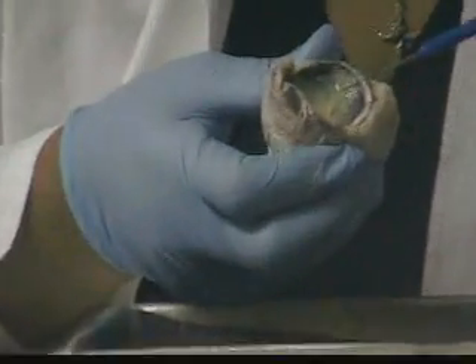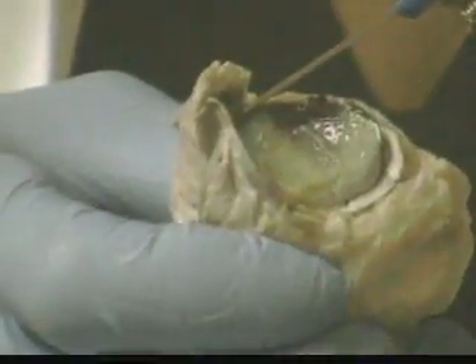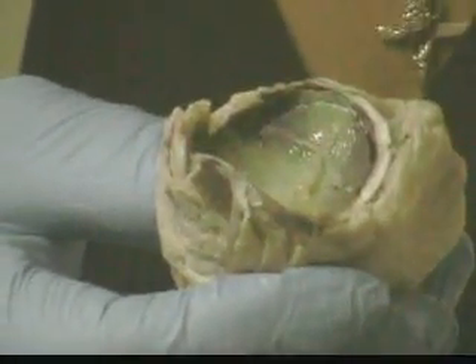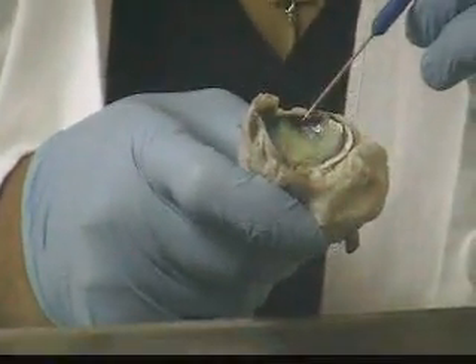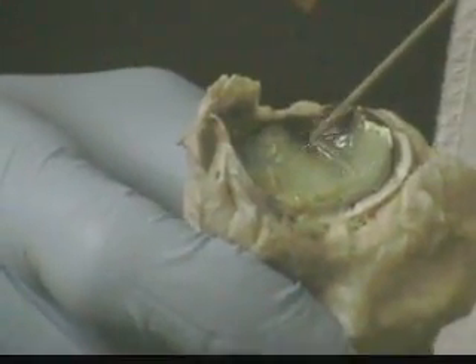This delicate membrane located at the posterior part of the eye is called the retina. The retina has two layers: an epithelial layer that abuts the choroid, and a neural layer where you find your photoreceptor cells — the rods and cones. Lateral to the optic nerve is a location called the fovea centralis. The fovea centralis has an abundance of cones, and that's where you have your discriminative vision and your greatest acuity of vision.